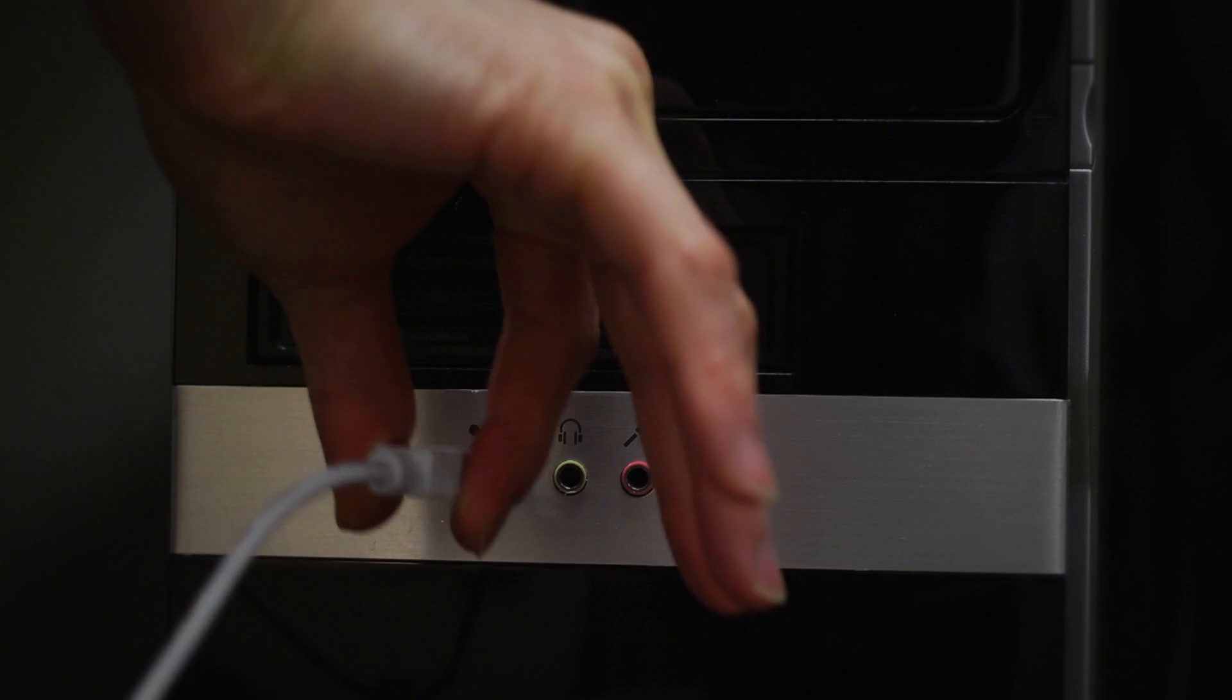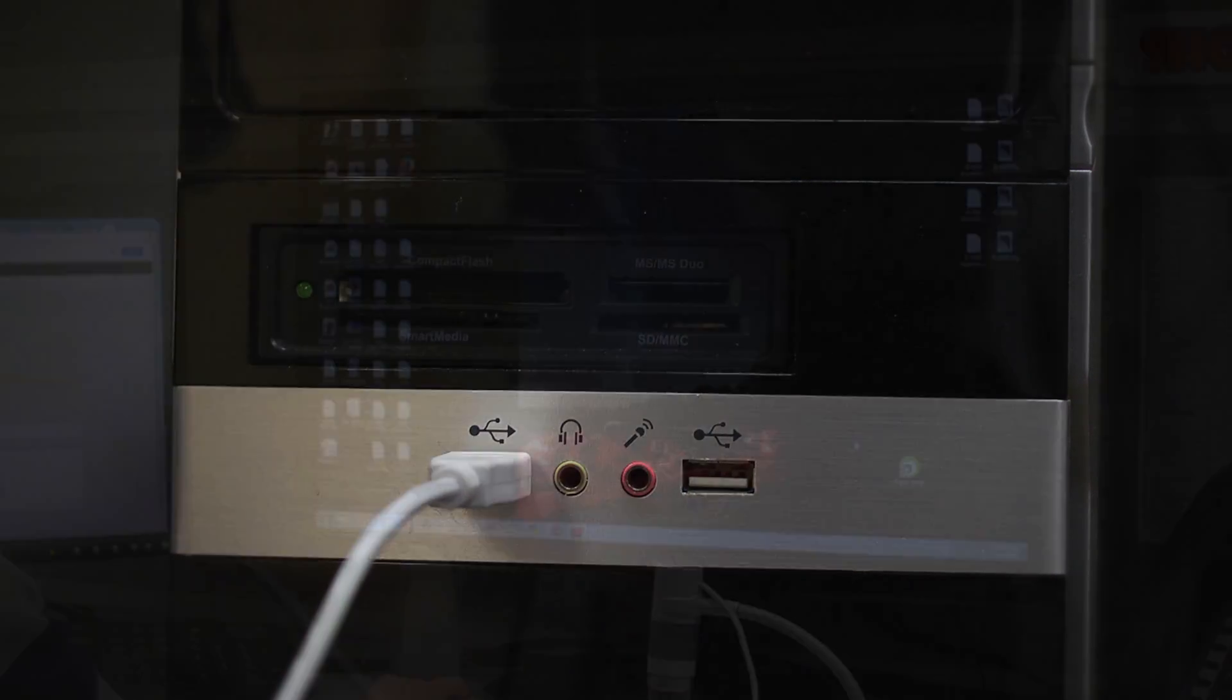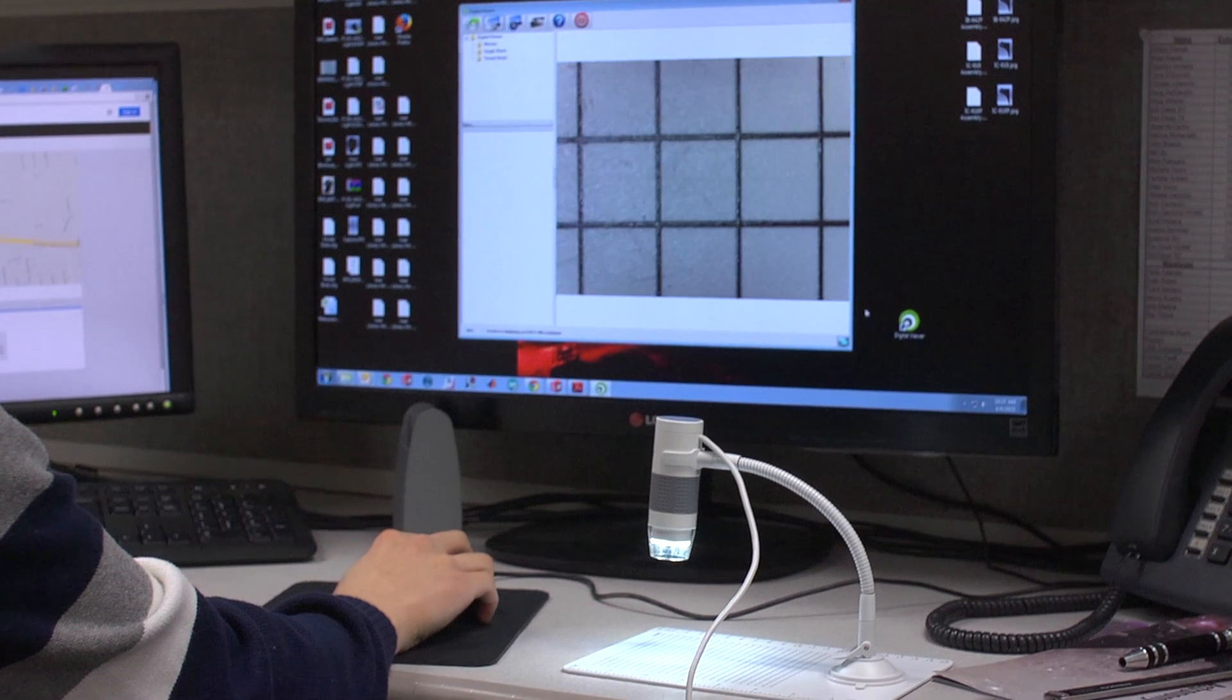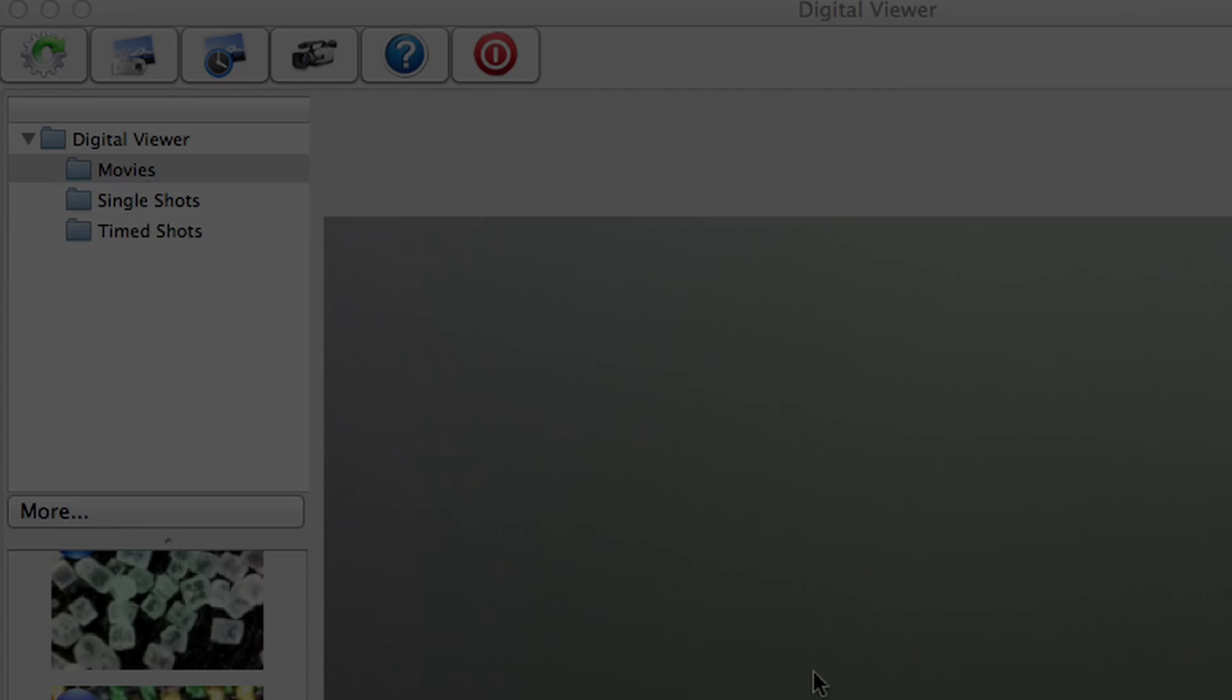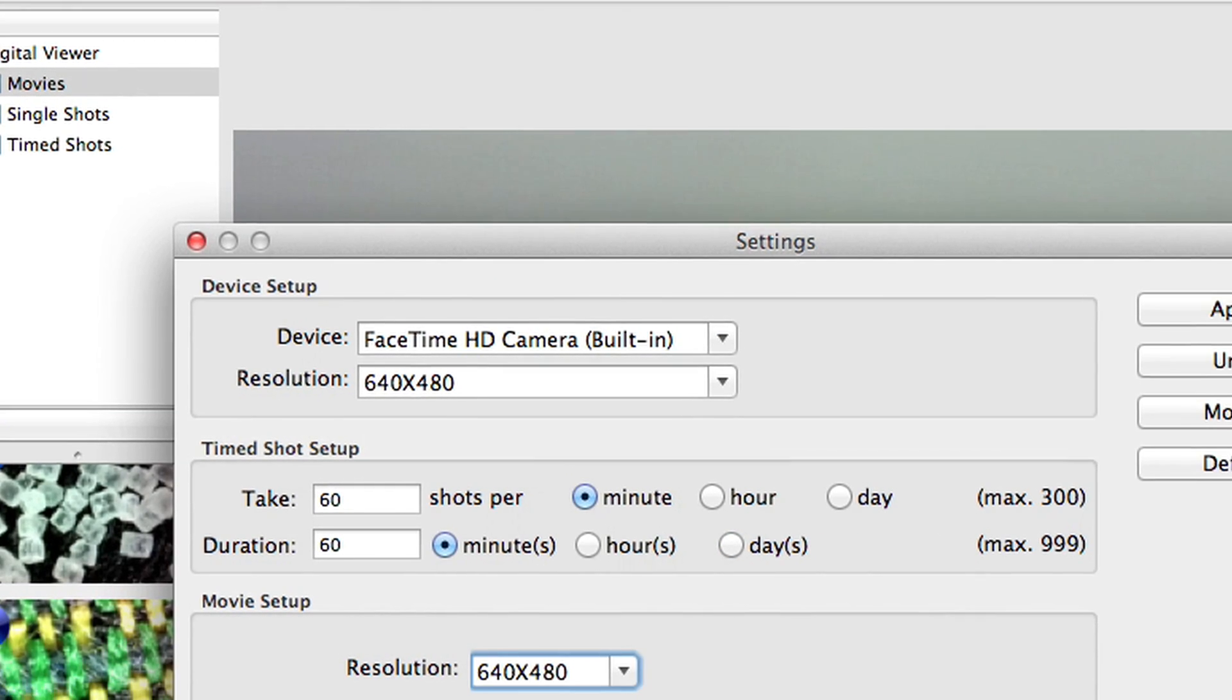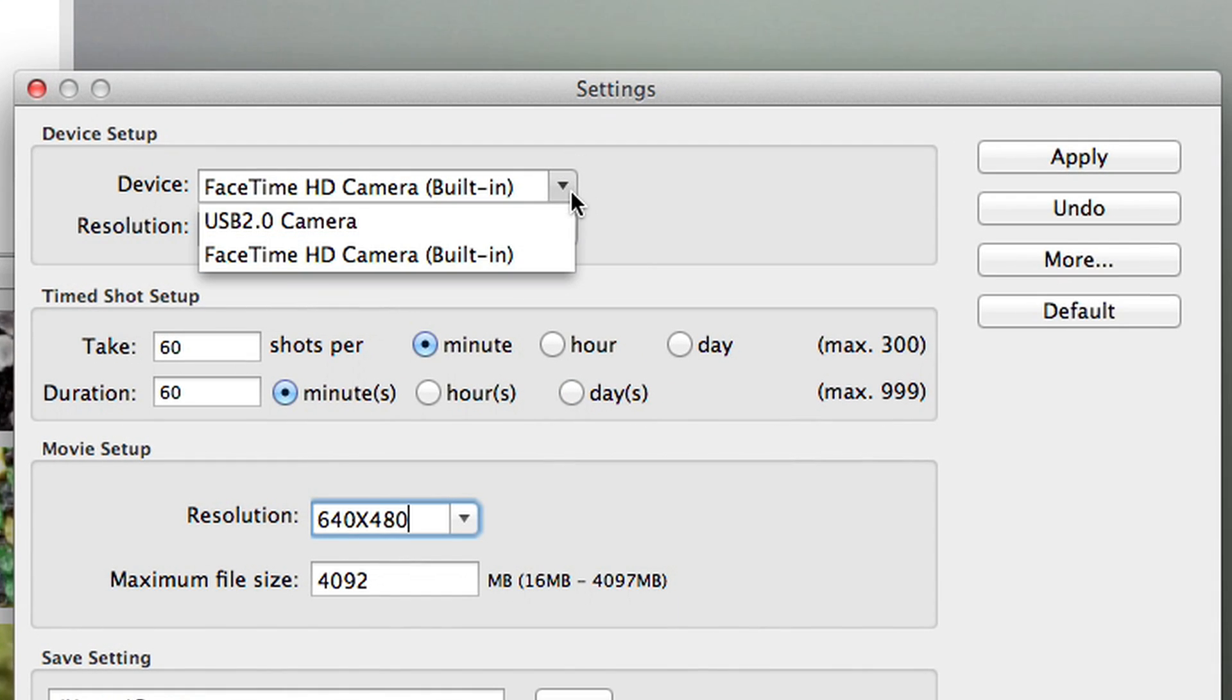The eFlex plugs right into your USB port. When you open the software the eFlex will automatically be activated. If not, just click the settings tab, go to devices, and select the latest USB driver.